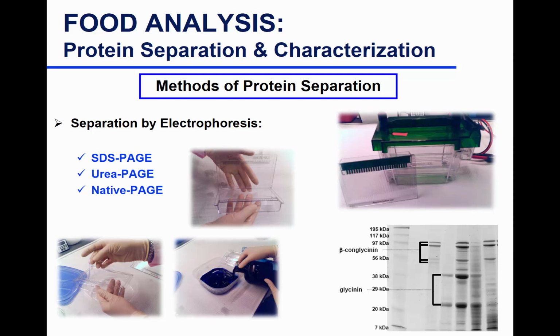I'm not wearing gloves. Is it because I'm old and I don't care? Or why do you think I'm touching the acrylamide with my hand and not caring, other than I'm old and don't care? It's a polymer. It's polymerized. Acrylamide will not hurt you if it's in gel form. So do you want to touch it? Are you going to trust me? Yeah, she trusts me.